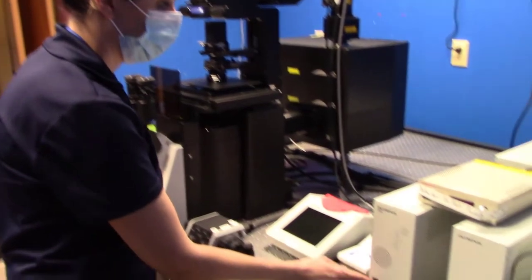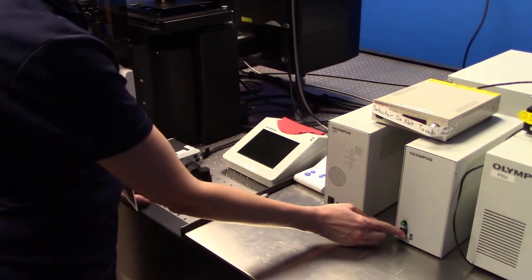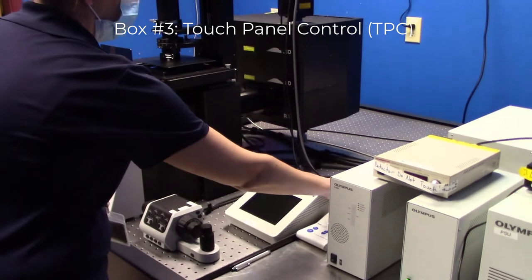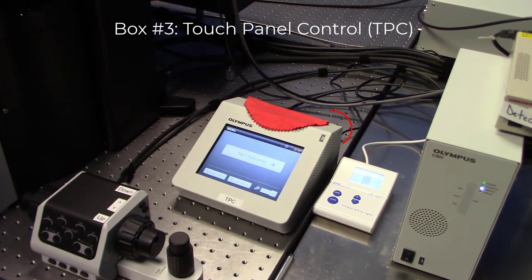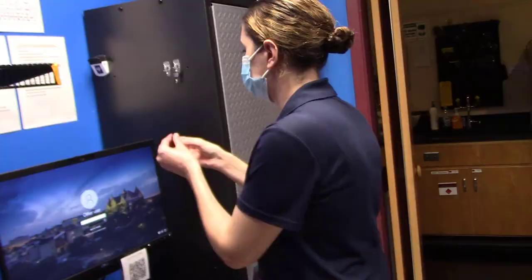To start the confocal, please turn on box number 1, the CBH, and wait for the beep. Next, turn on box number 2, the stage controller. Next, turn on box number 3, the touch panel control, or TPC, by pressing the power button located on the back right. Wait for the start operation screen to appear before continuing.